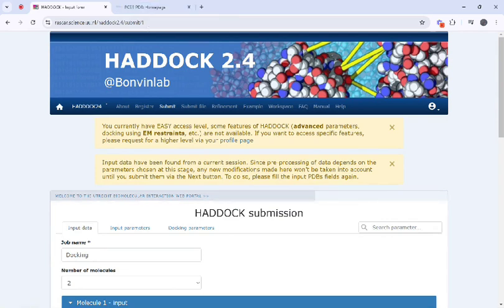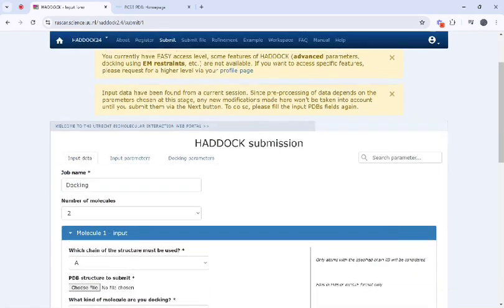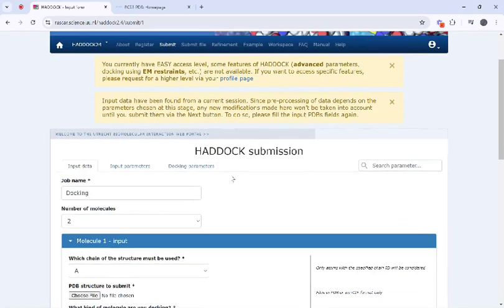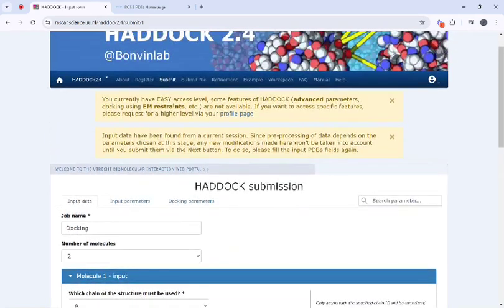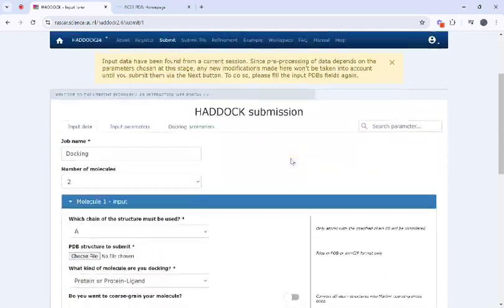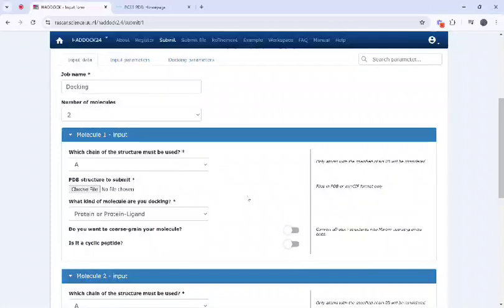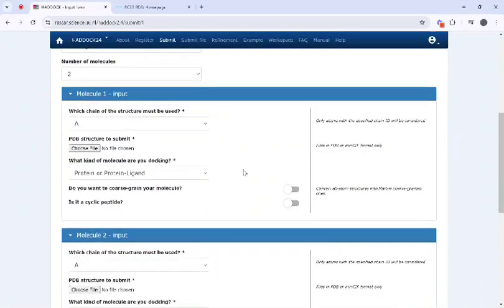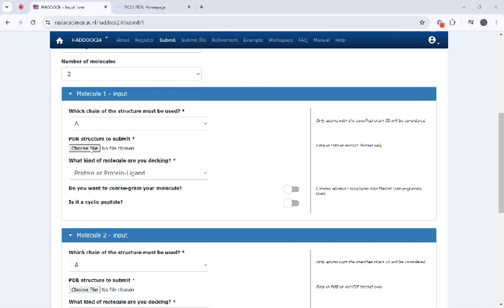Next you have to open the HADDOCK server and make your account. For this docking you need to upload your protein PDB file. I have prepared the protein PDB file so I will upload here.